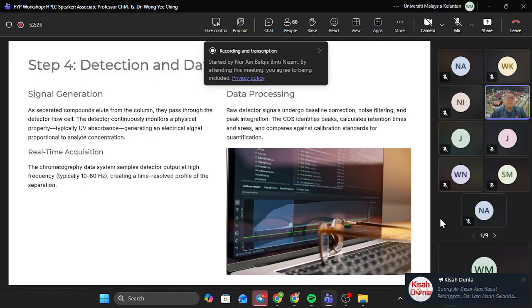This is much more towards quantification. For those who are doing a calibration curve, they can do it as a quantification process. You can also do it as a qualitative process using this particular instrument, so it can be done on both sides. But for quantification, you need to prepare a series of concentrations of the solution of the possible compound that you want to trace.